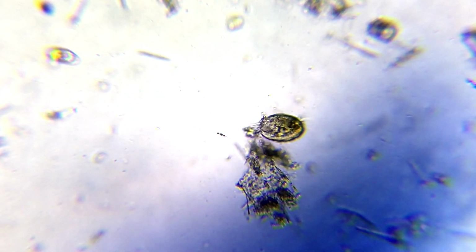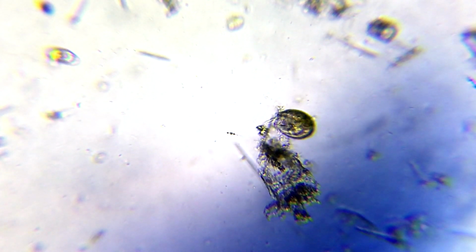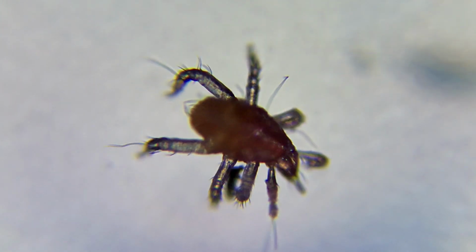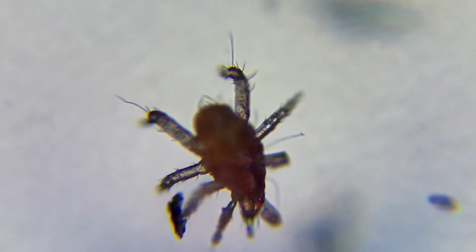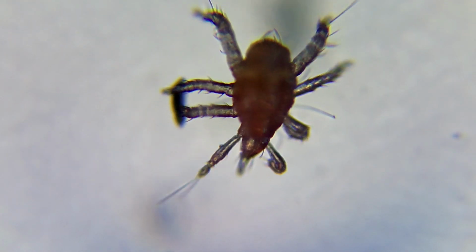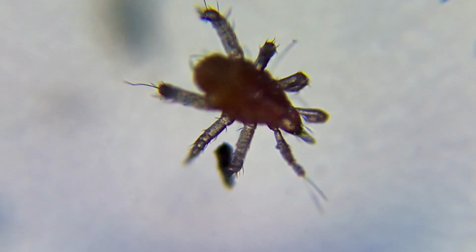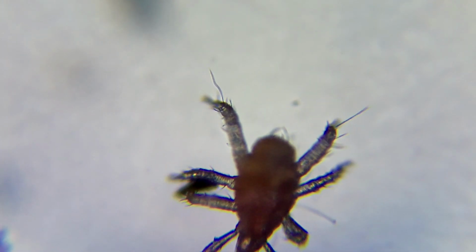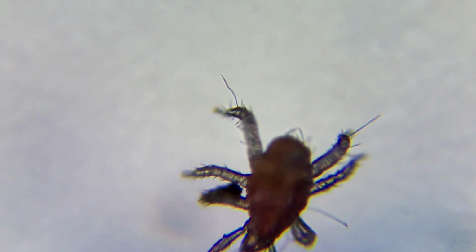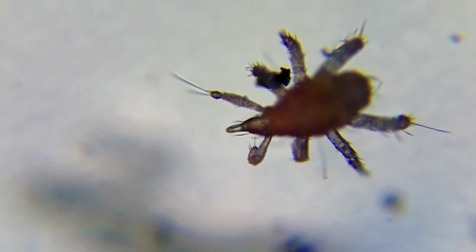If you know what any of these things in the video are, please leave what you think it is in the comments below. This is a mite, and same for all the other stuff. If you know what type of mite it is, please leave it in the comments below. I love how that looks like it would be an actual bug in our world, whereas everything else looks like a tardigrade or a nematode, and does not look like it's actually in our world.